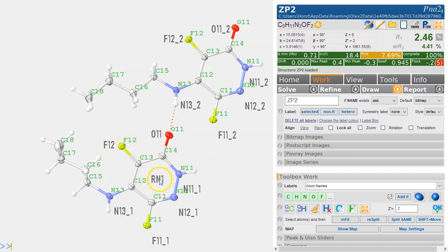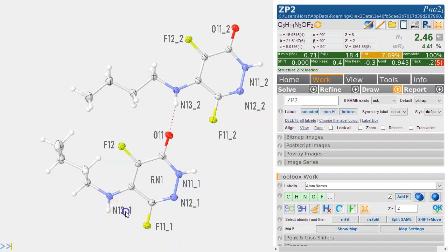Shift and the left mouse, you can move them about. F3 of course switches off these working labels, and these ones you can just move with shift and the left mouse in the right place. So there's a number of options here.